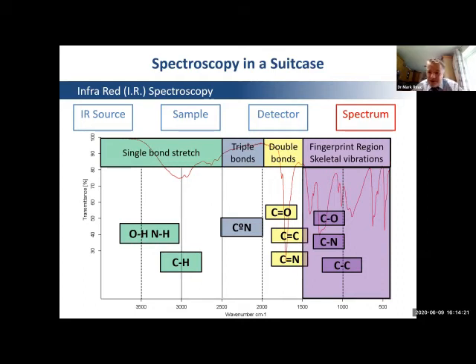There are some peaks though that are on the cusp. So for example, a carbon single bond oxygen is around 1200 or 1300 wave number. That's a grey area in between. But in general, we avoid this area and just look to identify the key peaks.